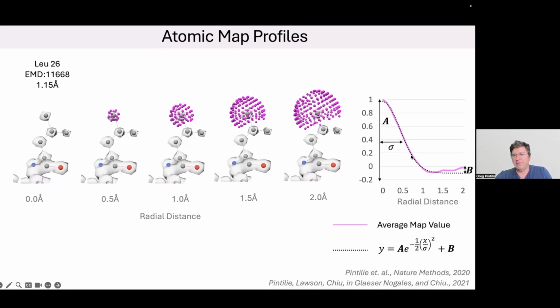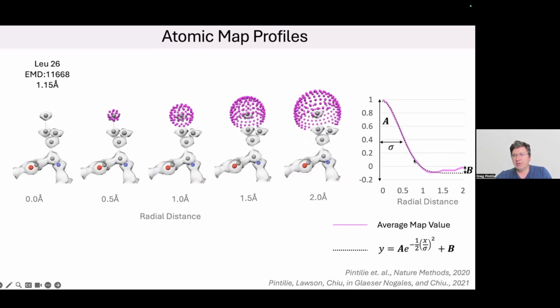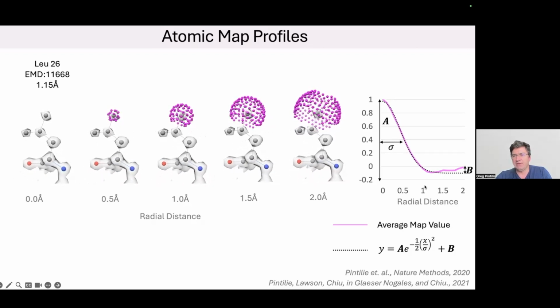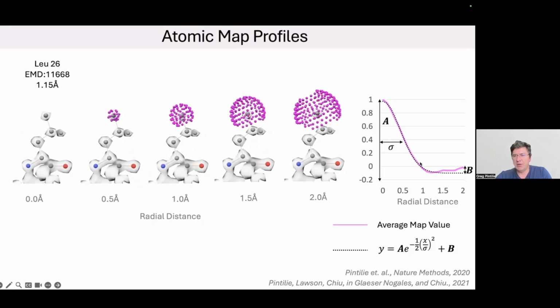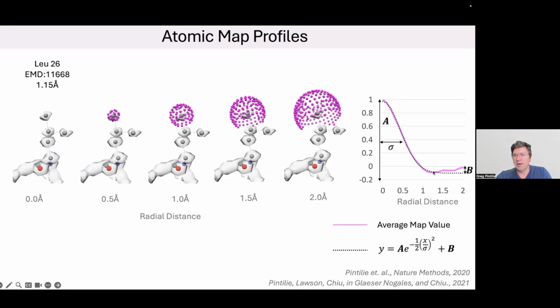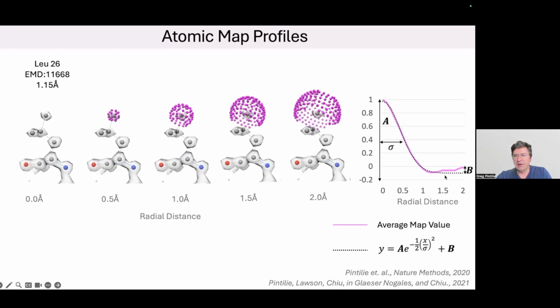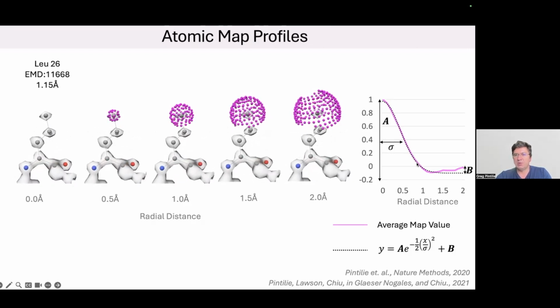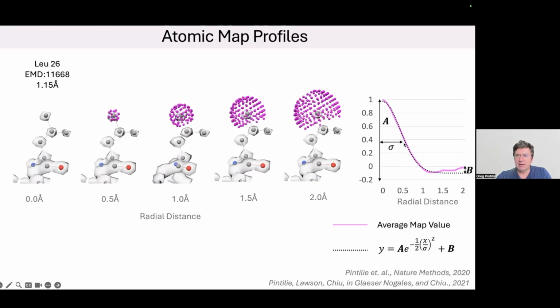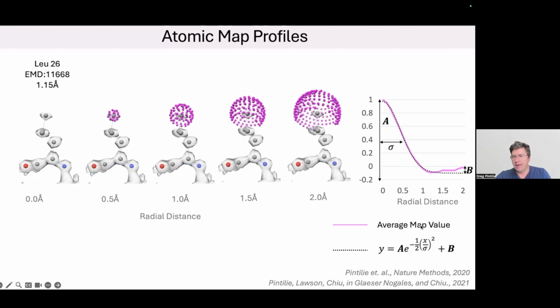And we can even fit an actual Gaussian with this dotted line as a Gaussian function. So we can fit a Gaussian function to this, and it turns out to match pretty well. The tail kind of trails off a little bit, but for the most part, it was somewhat surprising how well even a single Gaussian can fit this curve.